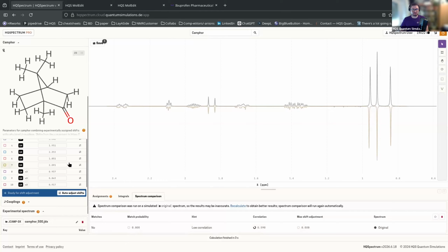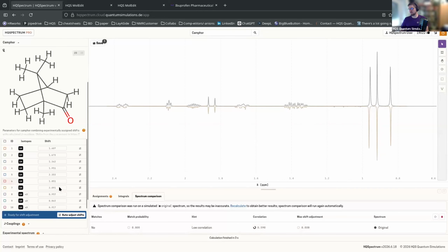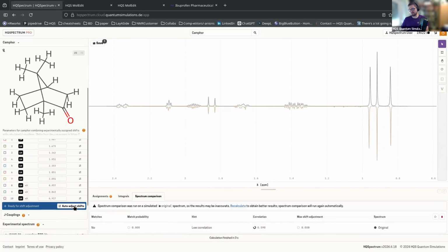And now I have multiple opportunities to improve on this matching, which is by eye maybe also rather good, but I can improve on it with two options of an auto adjustment tool, which we have: a really precise one and a fast one.